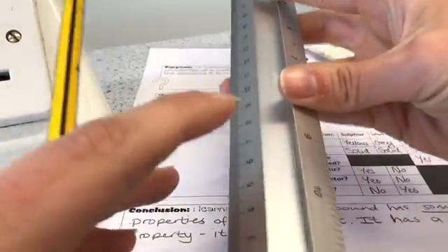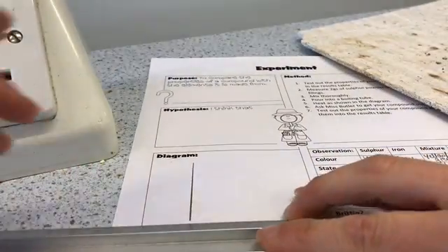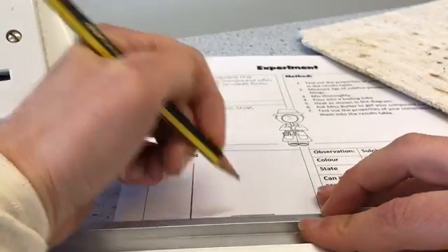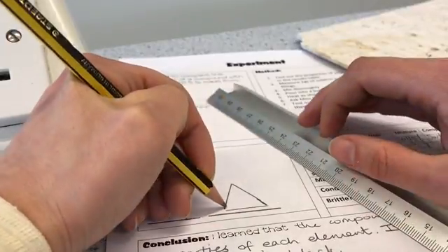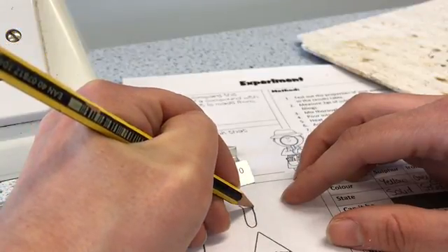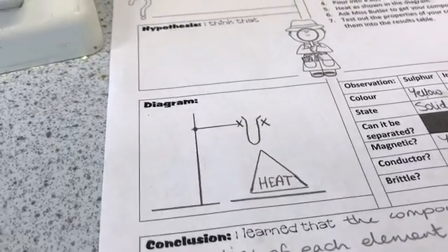Remember that you must use a ruler and a pencil to draw diagrams. Start by drawing your stand, boss, and clamp. Draw the base the other way round to normal because that's how we had it to fit the Bunsen burner underneath. You can draw your boiling tube freehand because it has curves. That's what your diagram should look like before labelling — now add the labels.